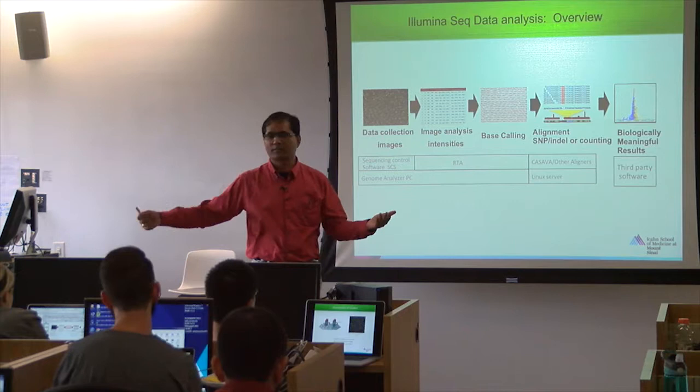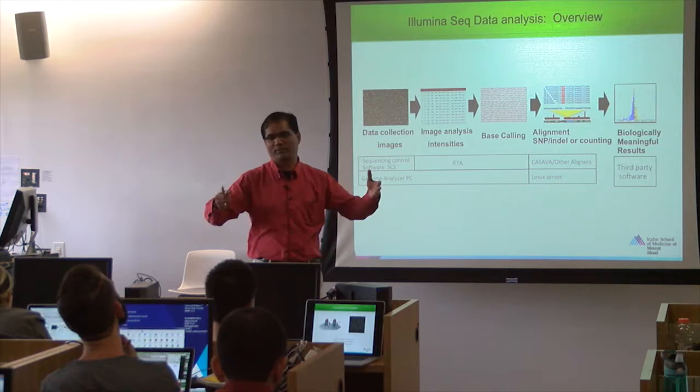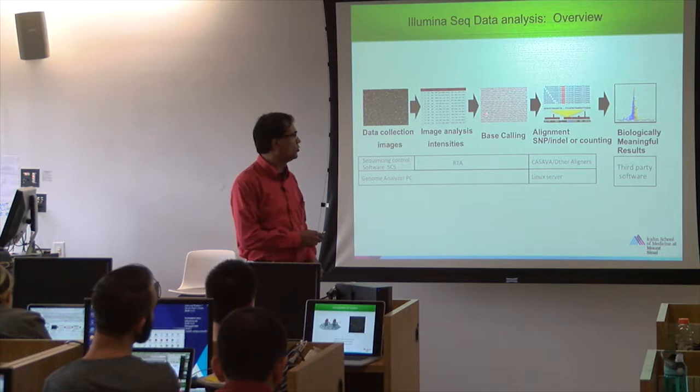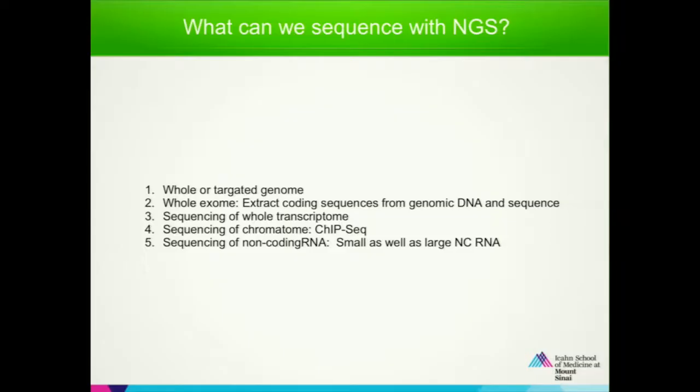Indels, SNPs, right? Is it a real error, or is it an error during sequencing, or is it a real mutation? Insertions, inversions, translocations, whatever you want to discuss, analyze, understand, you can do that. That is how you generate that sequence, and then you get the biologically meaningful results from that. That could be in research, or that could be in medical treatment. Clear?